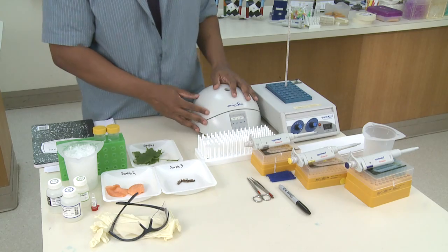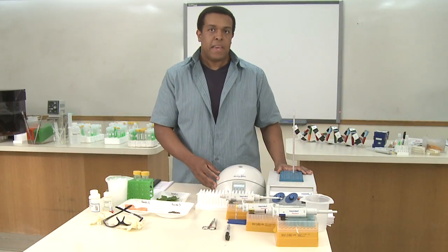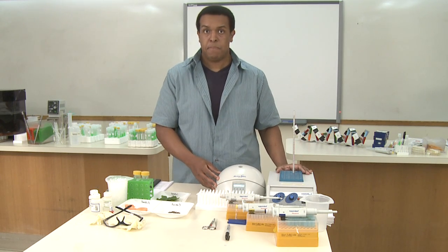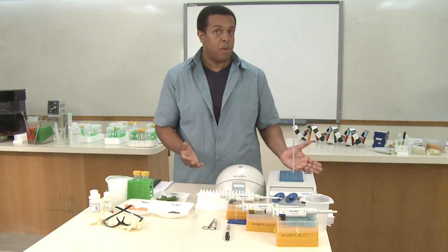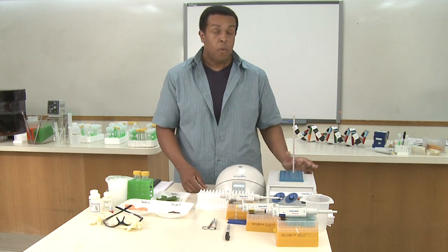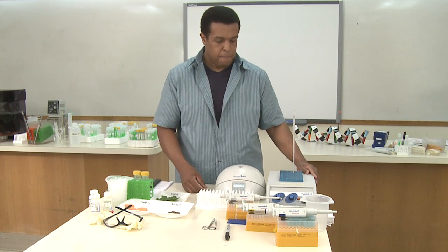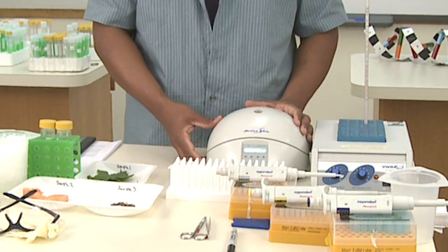For the larger equipment in this step, you'll need a heat block or a water bath. You need to have a heat block set at 65 degrees and one at 37 degrees. If you only have one heat block, just allow yourself enough time for it to cool in between steps. If you have a water bath, it's easy to change the temperature. We're going to start at 65 degrees, so please set your heat block at this time. You'll also need a microcentrifuge in order to spin your tubes down.